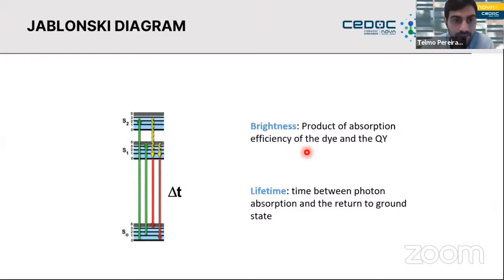It's not 100% correct. There are a lot of things that can change the brightness of your fluorophore in your final sample, but still it's a good indication of what you can look at to compare 2 fluorophores. If you have both on hand, you could pick the better one for your particular sample.